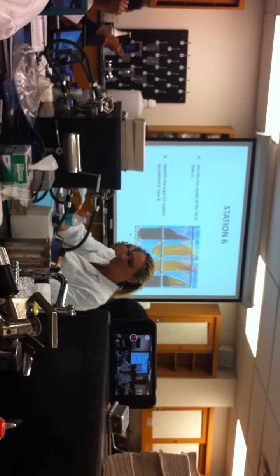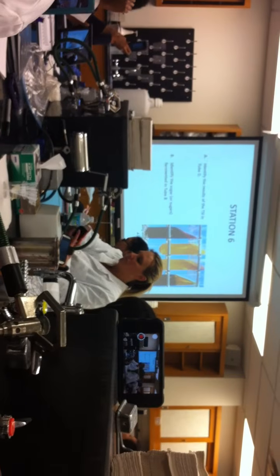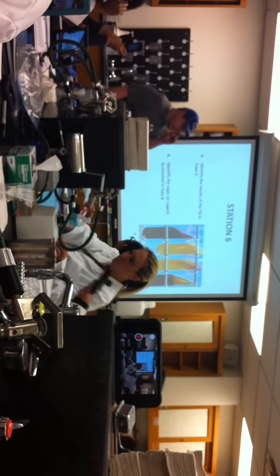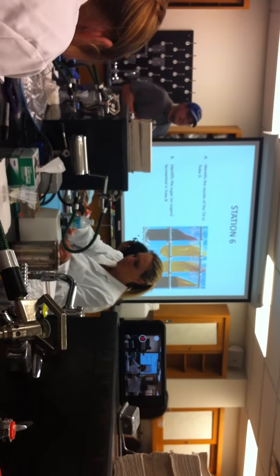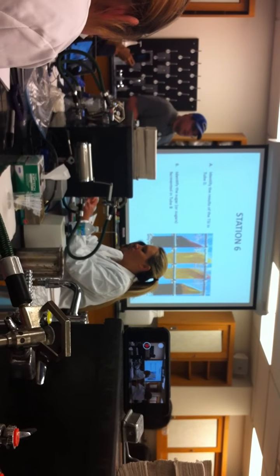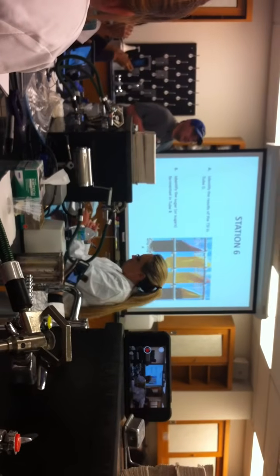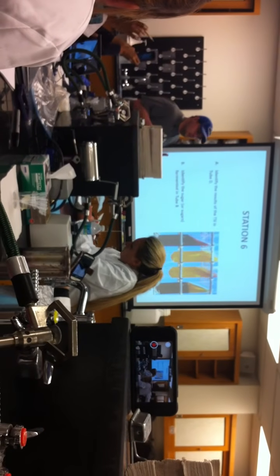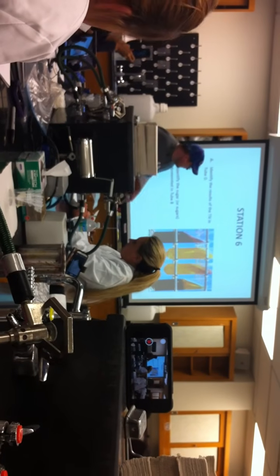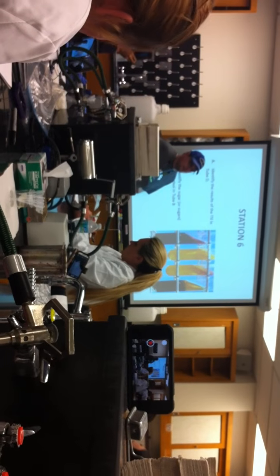Alright, so we didn't do the nitrate test, so you don't have to worry about it. Now, y'all remember we went over this specific thing. It is in your PowerPoint. Now, we did this in lab in that multi-tube, right? However, I want you to know how to read these kind of tubes. It is important to me. It will be important to you. So, what is this result? It is black. It has red at the top, which means what?